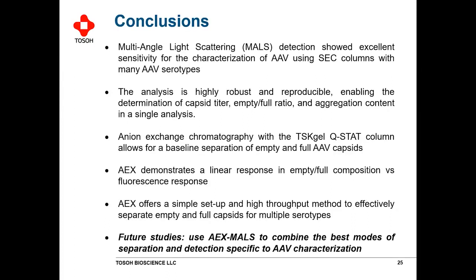The next step that we're working on right now is merging our AEX QStat method with the multi-angle light scattering to combine really good separation with really good detection to give you a really robust AAV characterization suite.